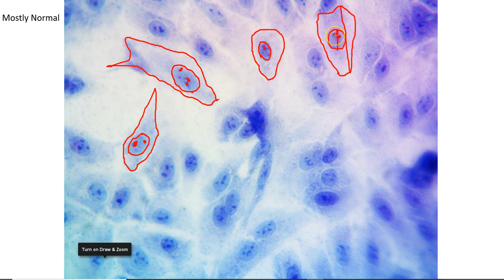And then again, this one only had 2 nucleoli, and those were pretty nice and clean, so that was a good normal cell. So if you look over this culture, the majority of this contains typical normal cells, and I don't actually see any dead or dying cells in here, so this is a very clean, untreated culture.